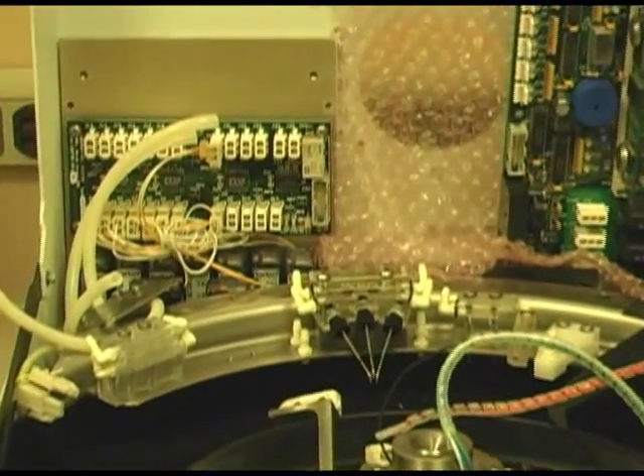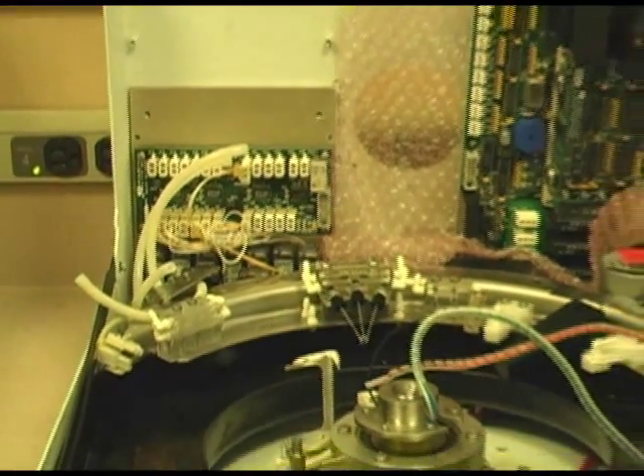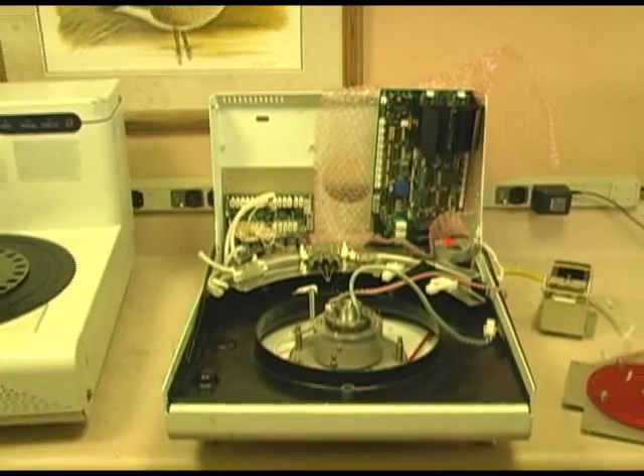Thank you very much for attending this session of training on the Benchmark slide staining systems manufactured by Vantana.